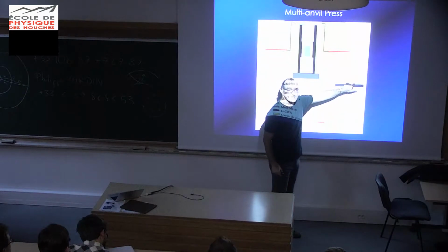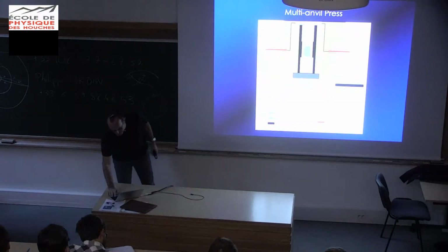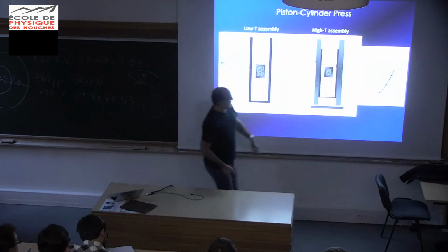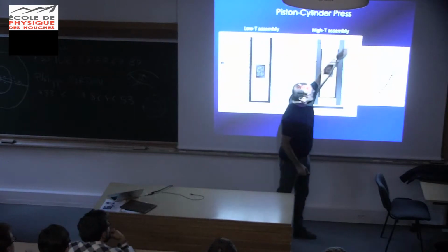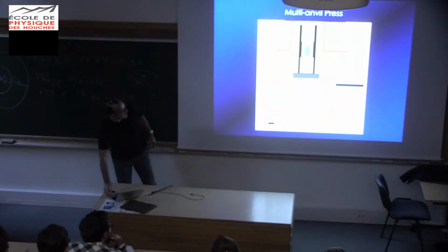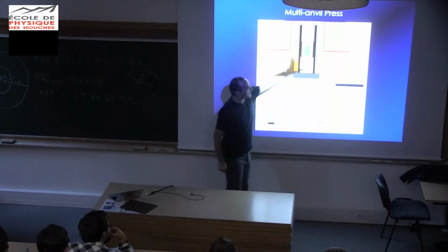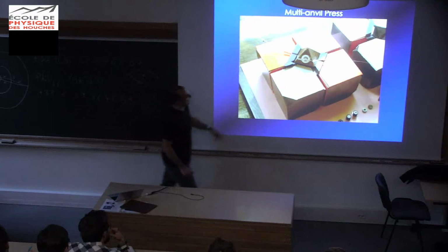Notice the sizes now. I don't think I highlighted the sizes for the other press, but it was 8 millimeters, 31 millimeters, and now you're down to 5, okay? So it's much smaller, but smaller takes you to higher pressures, okay? This is the scale, all right? But the principle is the same. And this sits inside an octahedron, which you're going to see here.